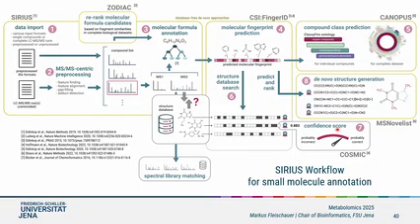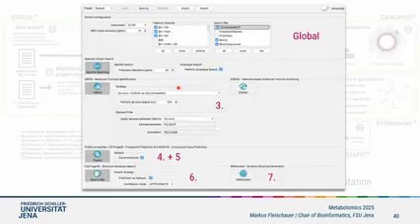Yeah, so let's come back. That's basically this full workflow, which is a lot of stuff. But the good thing is, in the software, it's not. This is basically all the parameters SIRIUS has that you have to care about, and the large buttons are usually just to activate things. So there's not too much to set. The most important part is specifying the adducts that are possible and selecting the databases you want to search in. And here's the part with the strategies.